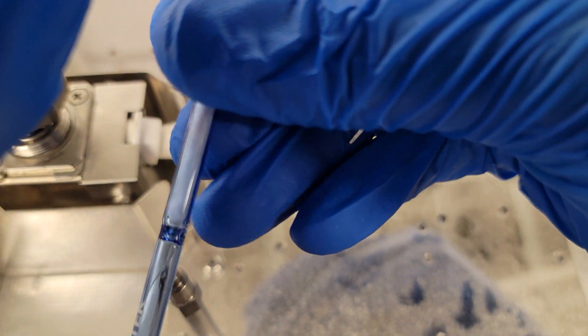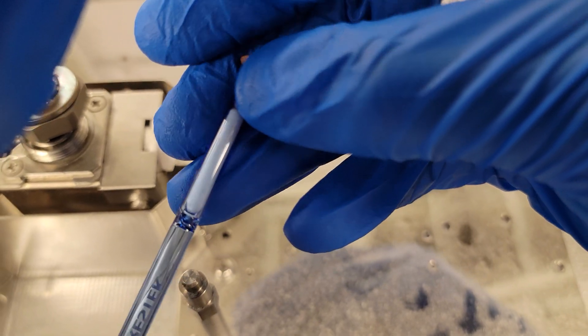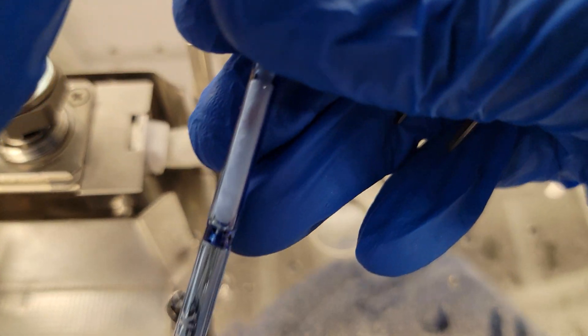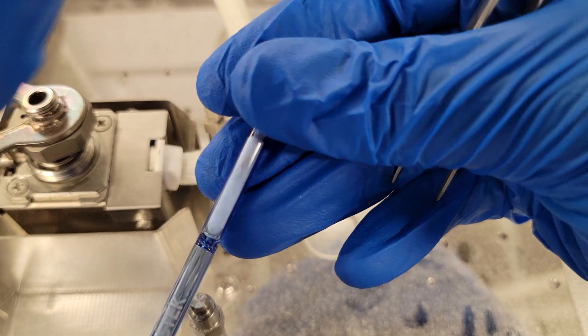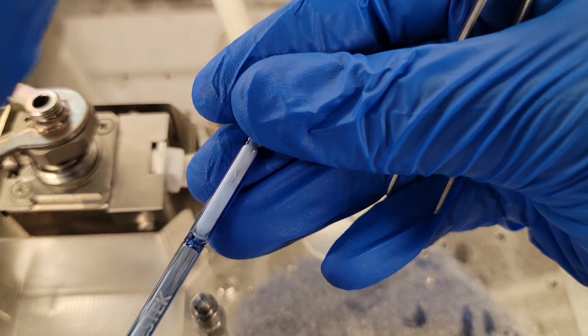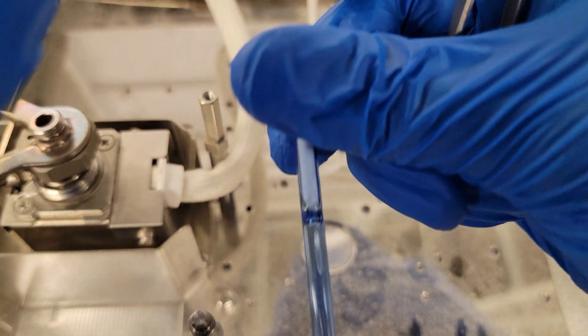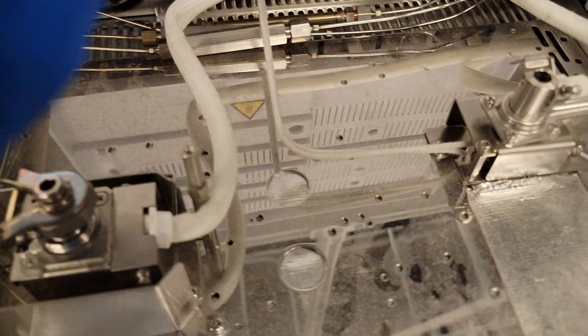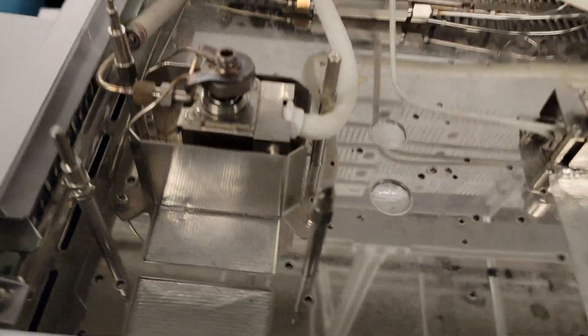Let's see if we can see if the wool is damaged at all. This one looks pretty okay, but it's been about 120 samples, so we're going to replace it now as well as the o-ring and the septa. I'll set the old one to the side.